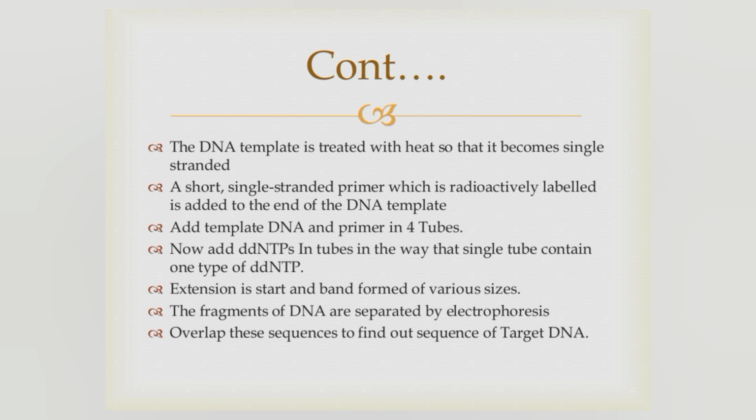So extension is terminated and fragments of various sizes are formed. The fragments of DNA are separated by electrophoresis. Overlap these sequences to find out the sequence of the target DNA.